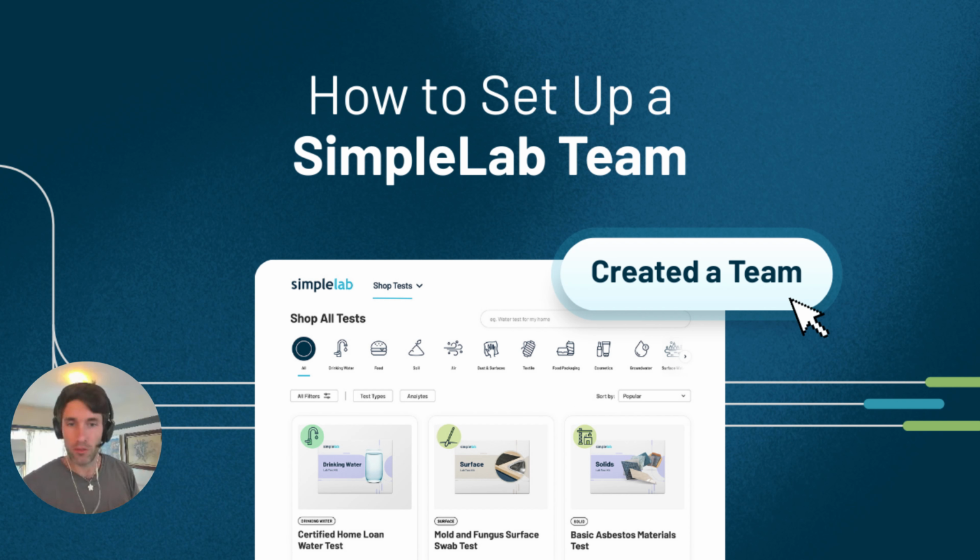Everybody, I'm going to walk you through the steps it takes to create a team on SimpleLab. A team is one of the most efficient, most helpful tools on SimpleLab if you are working with a bunch of colleagues or as part of an organization and you want to keep track of a larger number of tests over time in one place.